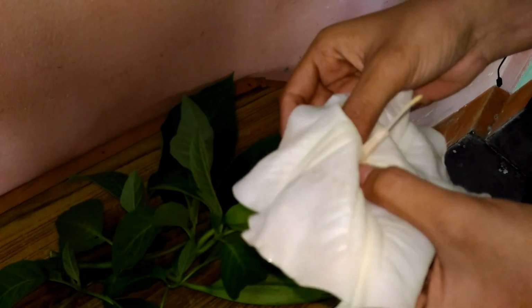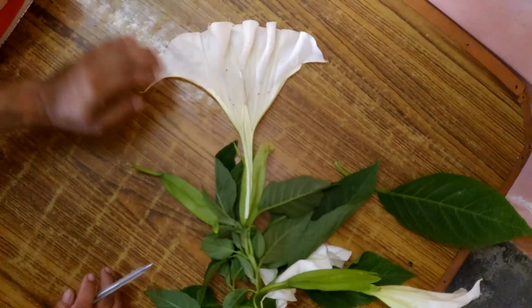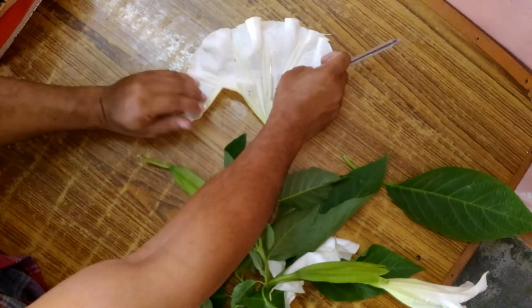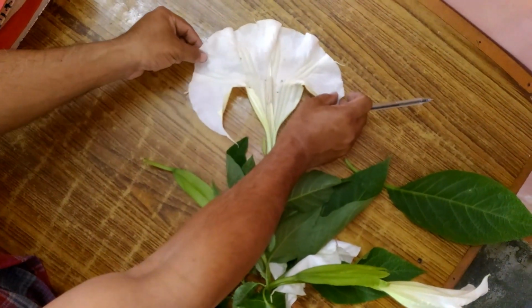These are the stamens along with the gynoecium. After splitting the corolla tube, the structure appears like this.